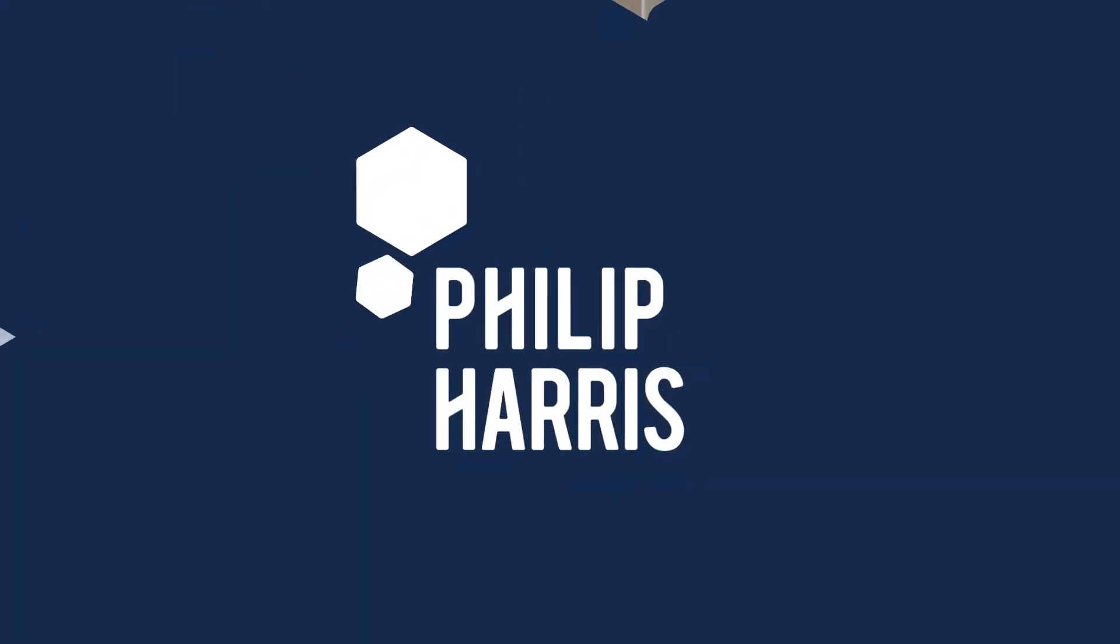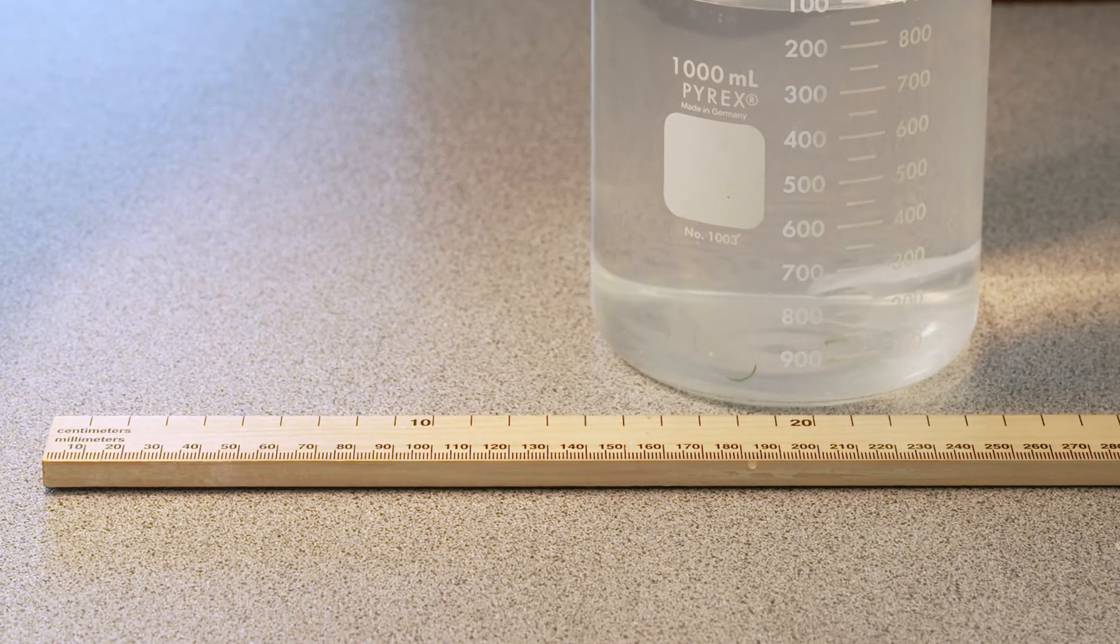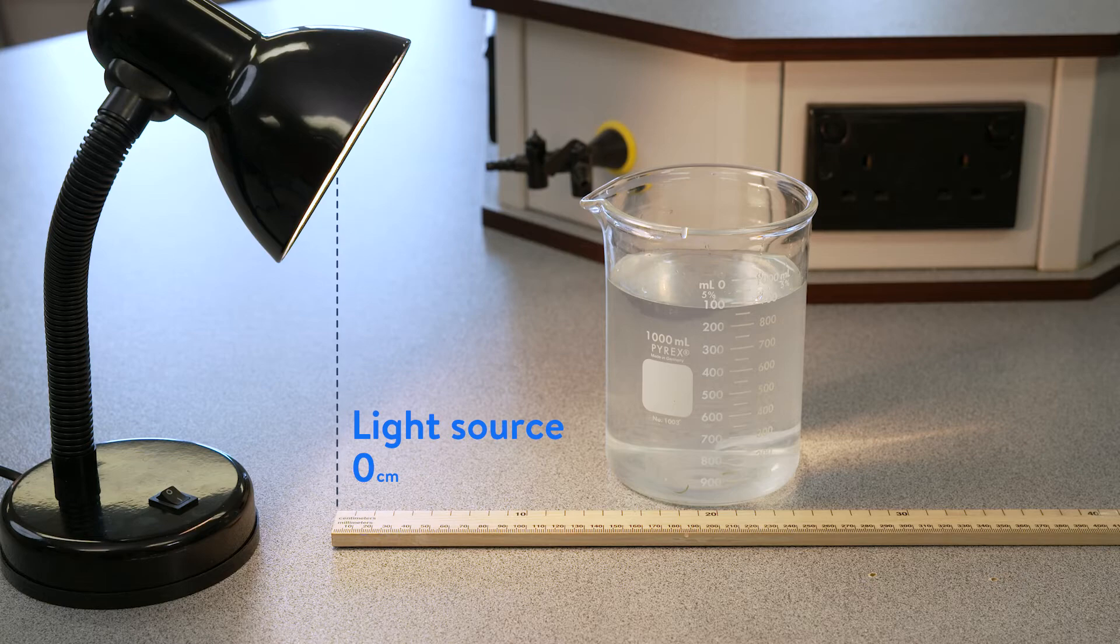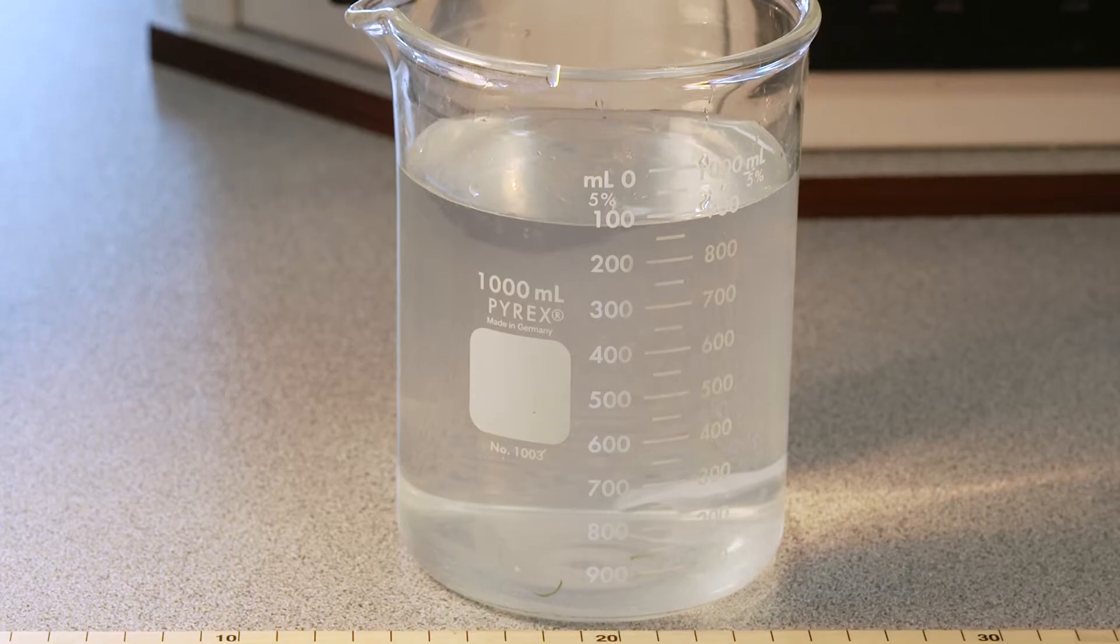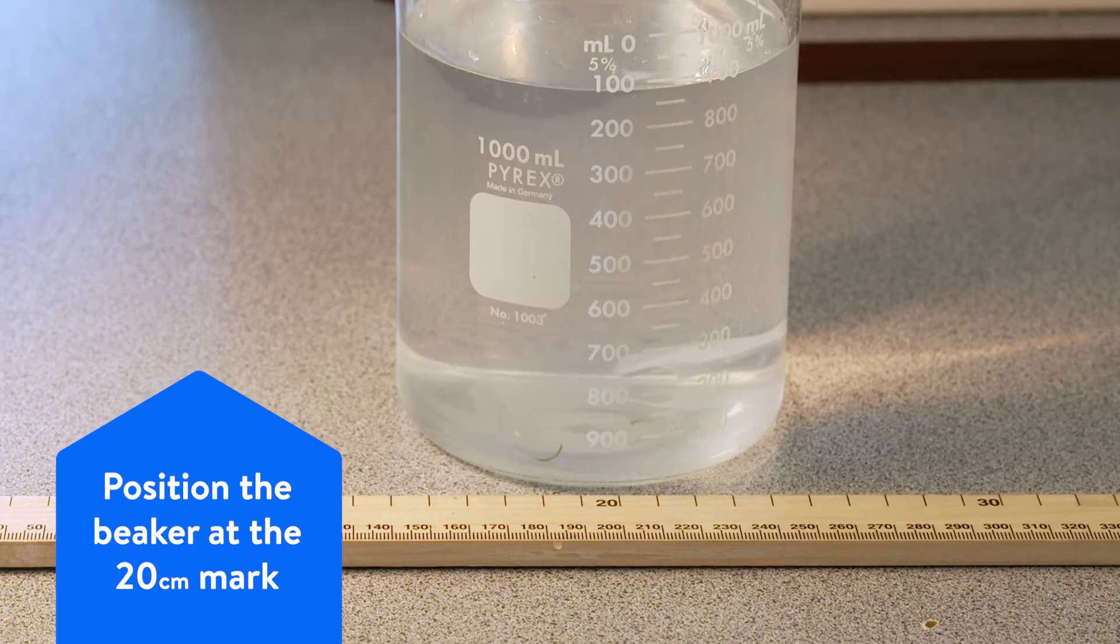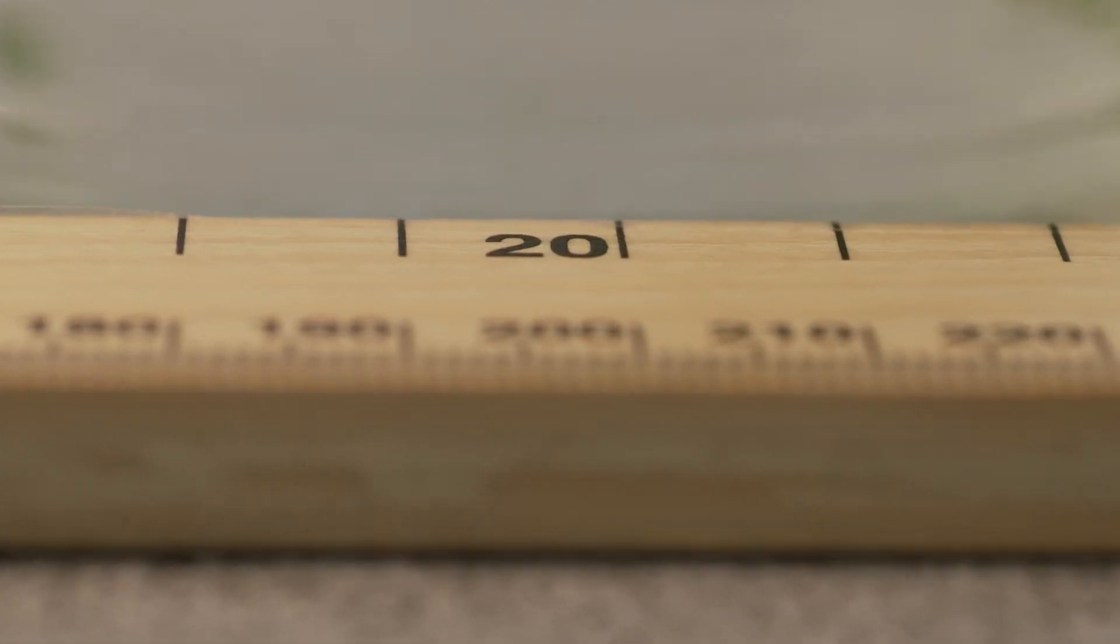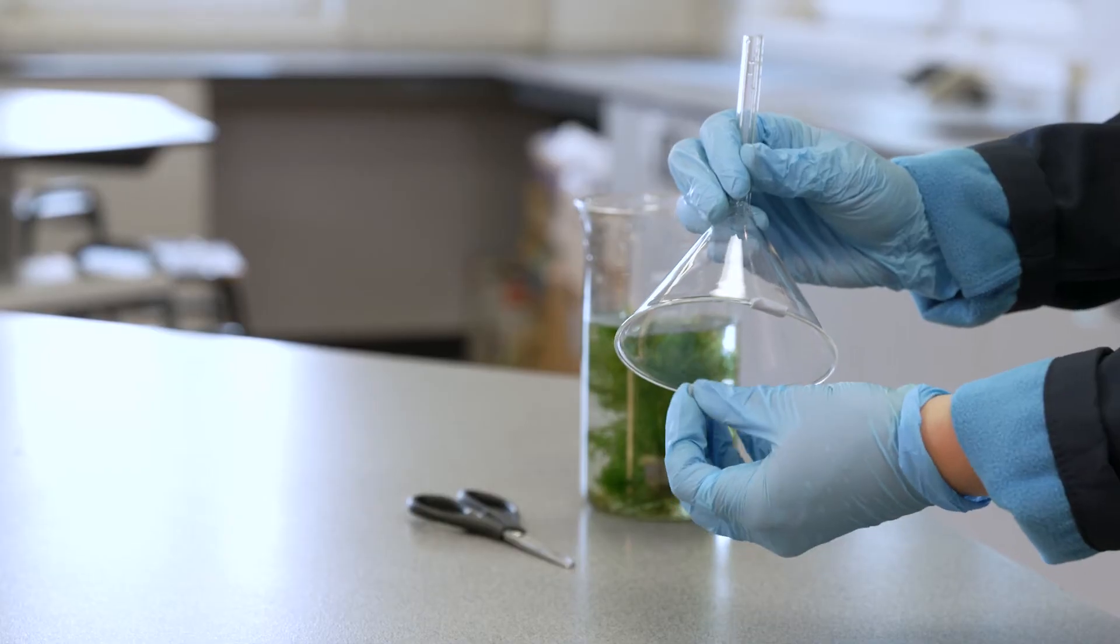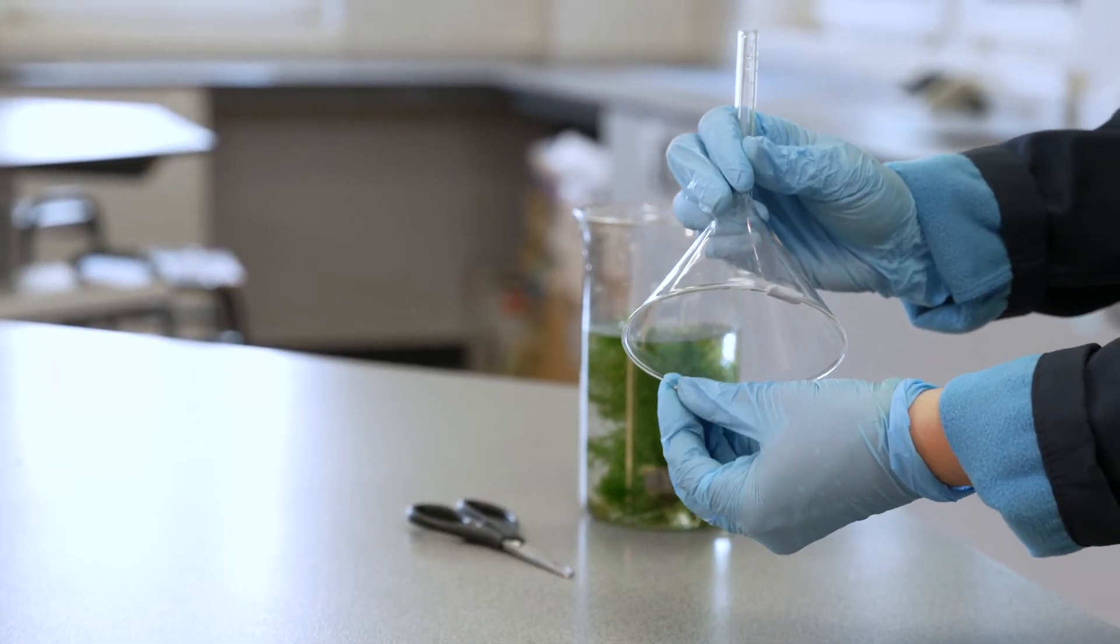To set up the experiment, place the ruler on the bench and set up the light source at the zero centimeter end of the ruler. Place the beaker of water at the 20 centimeter mark on the ruler. Now put two pieces of blue tack onto the rim of the filter funnel. This will help keep the funnel raised off the bottom of the beaker.